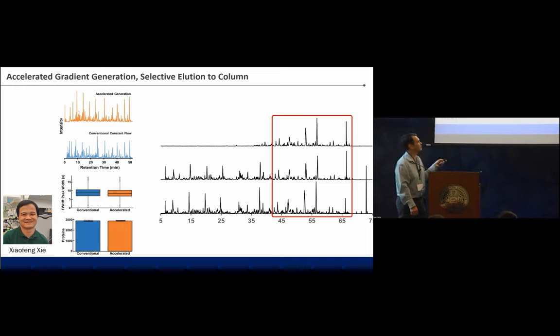All right. And on one of your slides, you had a fitting of some sort. Is it something also novel? No, that was just a Valco fitting, just showing that sometimes the low flow, high pressure connections can be difficult to troubleshoot. These fittings at low flow are not always trivial. So it's nice to have an autosampler that, once you set it up and it works well, just keeps working well, right? And in the two multi-column system that I showed, almost everything is done at low pressure except for the isocratic pushing. So there are fewer high pressure fittings in the system. I didn't explain it very well, but that was the point. Yeah. All right.